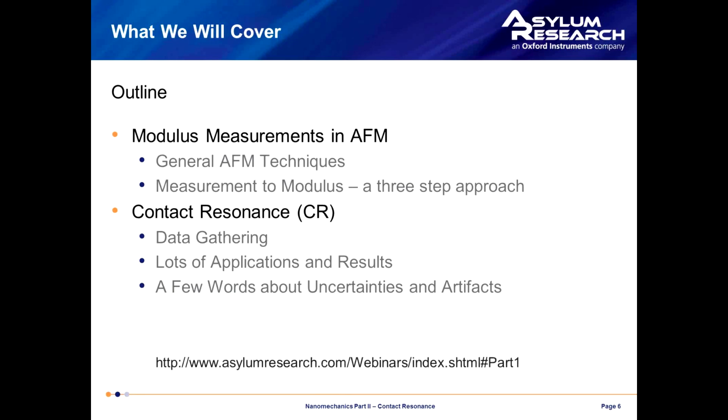I should also mention that if you're new to mechanics, or if you're new to nanomechanics, you may want to listen to our first webinar, which you can find on our website that Ben indicated. In particular, it involves a discussion about modulus and contact areas, which are important ideas for any kind of nanomechanical measurement, certainly for contact resonance.